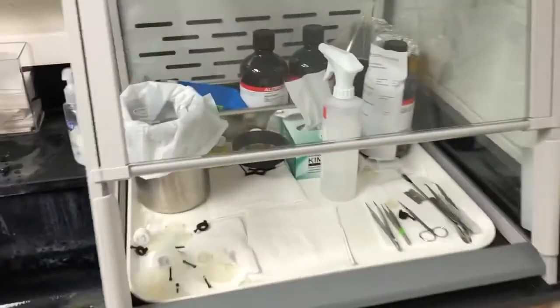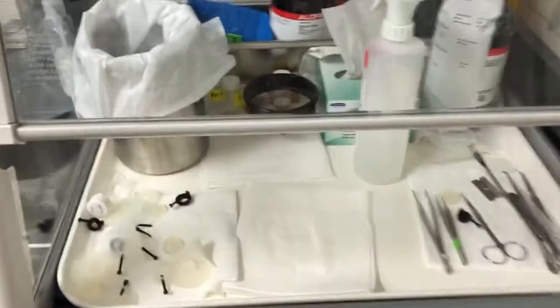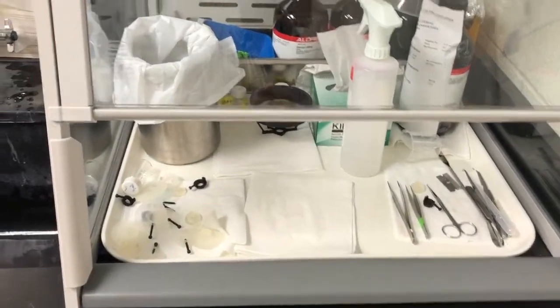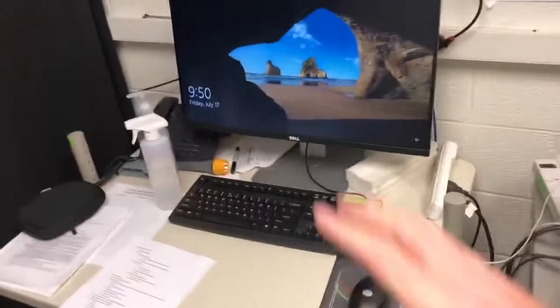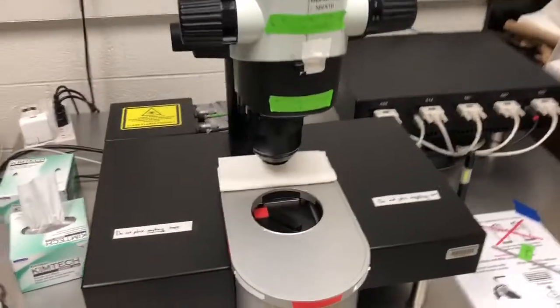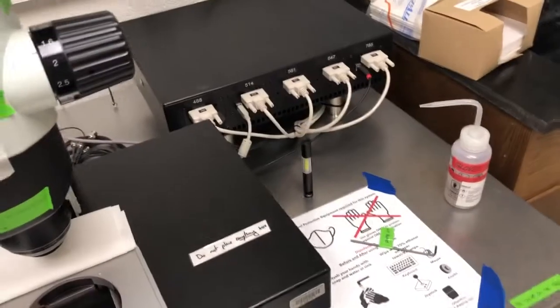The other part of this room that you will use is this fume hood, and basically everything in here you should touch with gloves. There is nothing in there that you should touch without gloves. So: everything in the fume hood with gloves, everything on the computer without gloves, and on the system most of it is without gloves but there are a few key elements that are only with gloves.